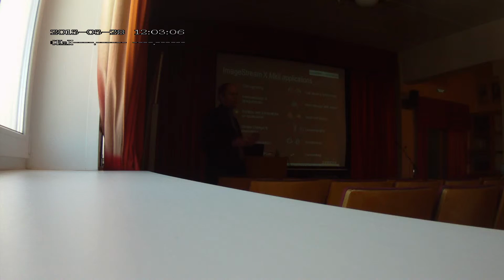Let me show you one, based on which I will try to show you how the instrument works and how it nicely combines the standard flow cytometry application with something a little more. We will look at cell signaling.